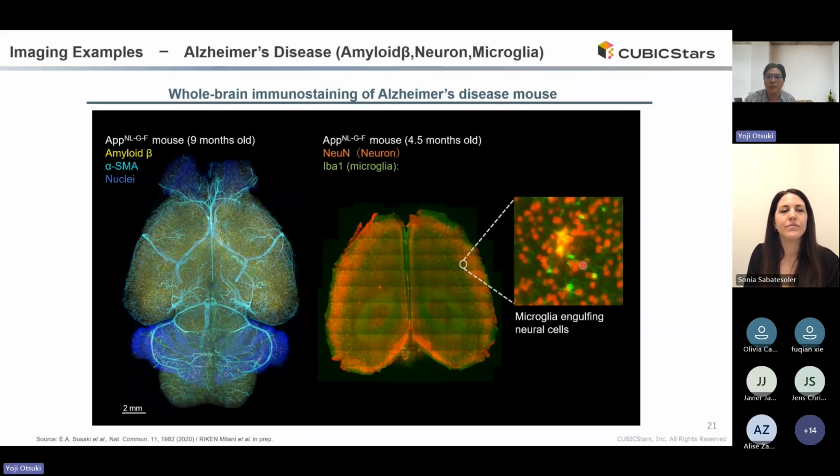So we can provide a little bit higher resolution imaging. But the issue with such high resolution imaging is that the data size also increases. So that's totally dependent on the experimental design, and we recommend getting the images with the minimum resolution you require for your experiments.